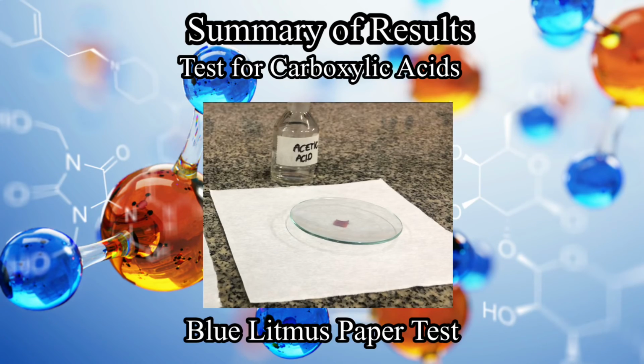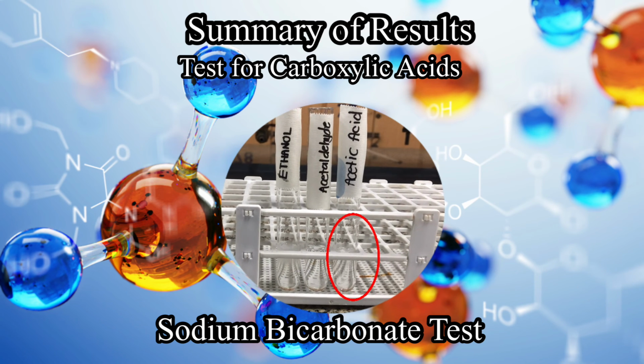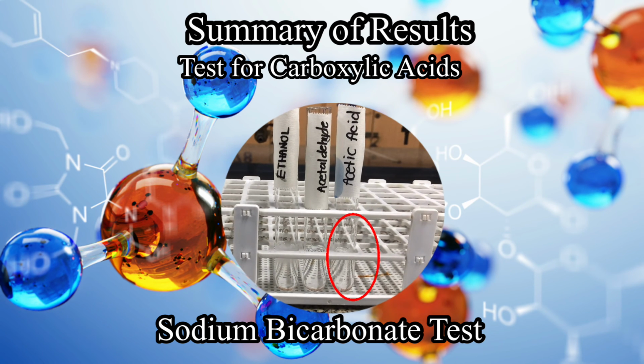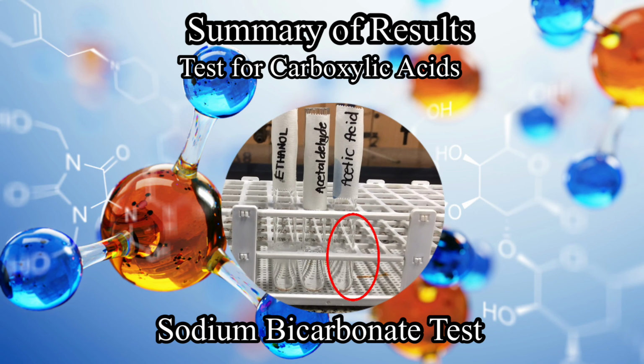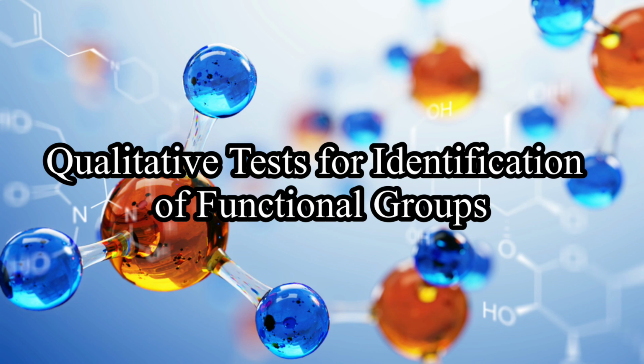As a summary, here is the result for the blue litmus paper test. And here's for the sodium bicarbonate test. So there you have it, the different qualitative tests for identifying common functional groups.